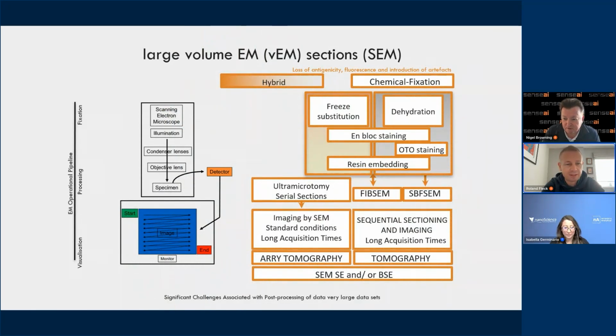Okay, thanks, Nigel. So I'm assuming we've got quite a diverse audience, so I'll build this up slowly. Any questions, put them in the chat. We're happy to answer them, provide additional information if required. But basically, Volume EM is just an offshoot of general electron microscopy. It's really come to the fore over perhaps the last 10 or so years, largely associated with improvements in the instrumentation. But what does it really mean?